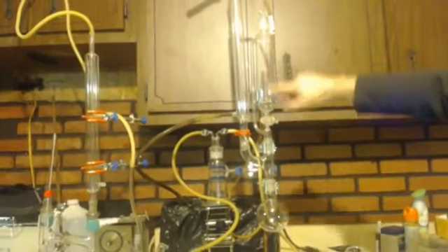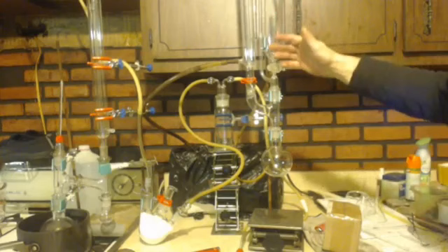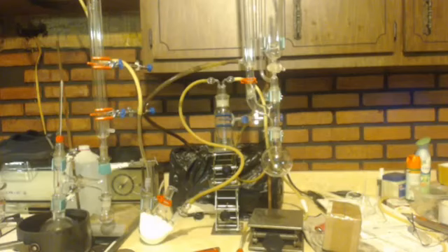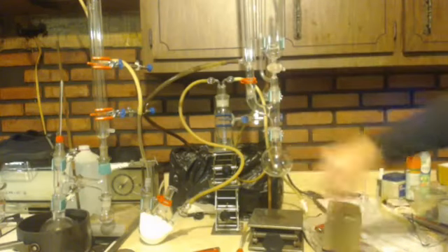separatory funnel, or equalizing funnel rather. I'm going to put my diethyl ether and my alkyl halide, which in this case is ethyl bromide. I'll put that in here, and I'm going to drip it in.